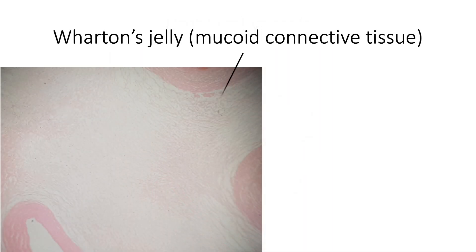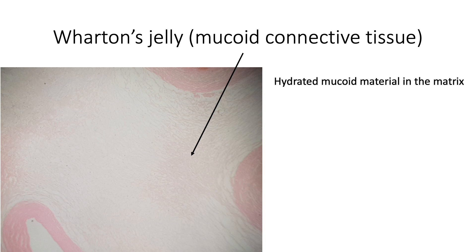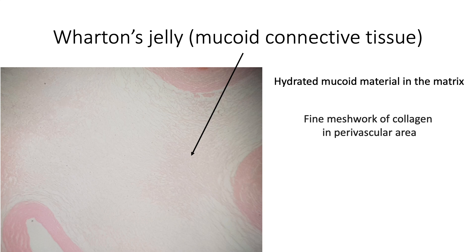Wharton's jelly, or mucoid connective tissue, shows hydrated mucoid material in the matrix, a fine meshwork of collagen seen predominantly in the perivascular area, and few fibroblast-like cells.